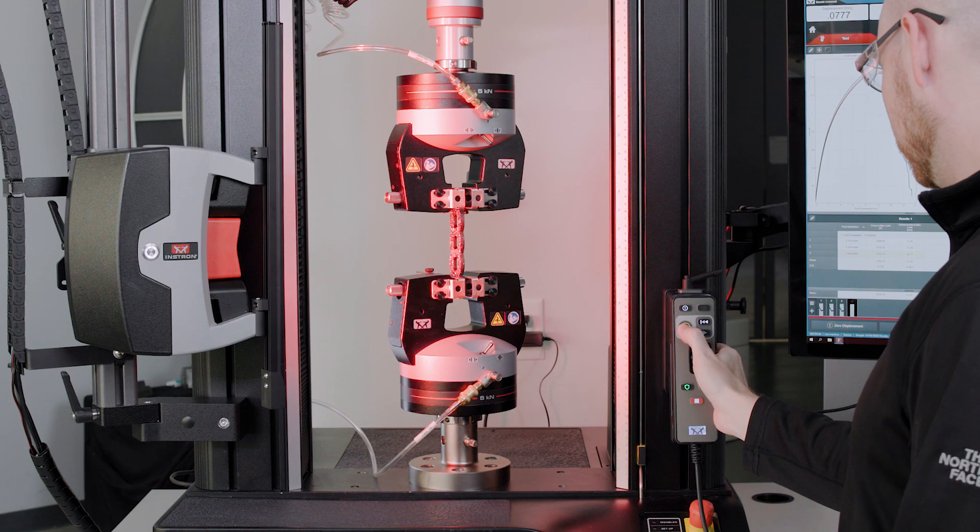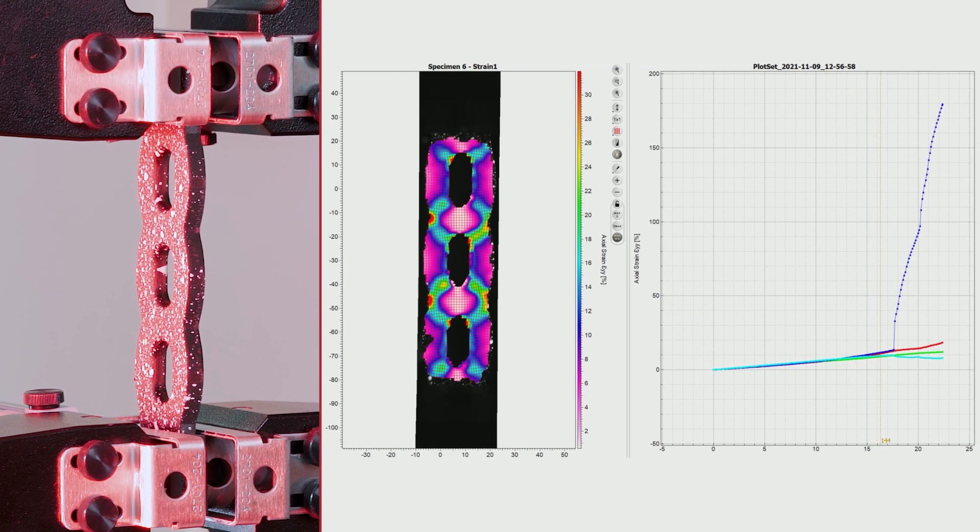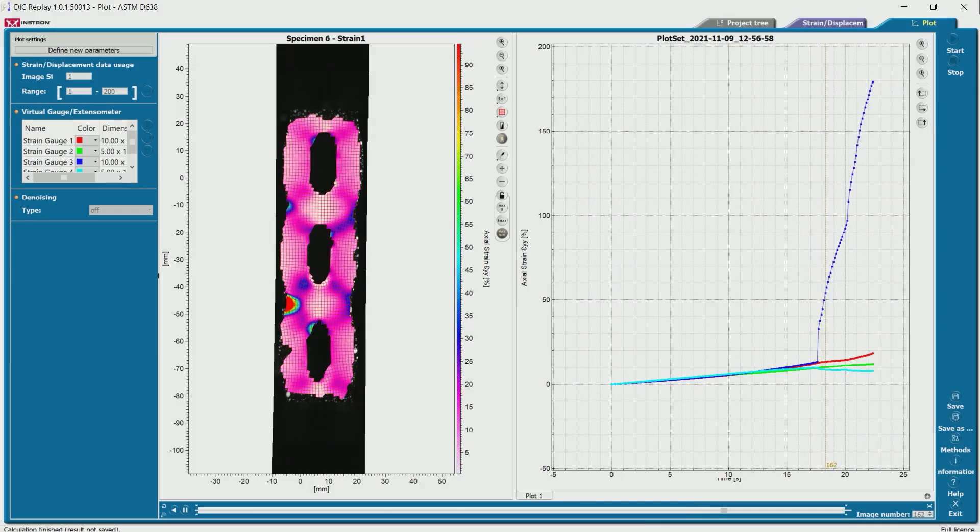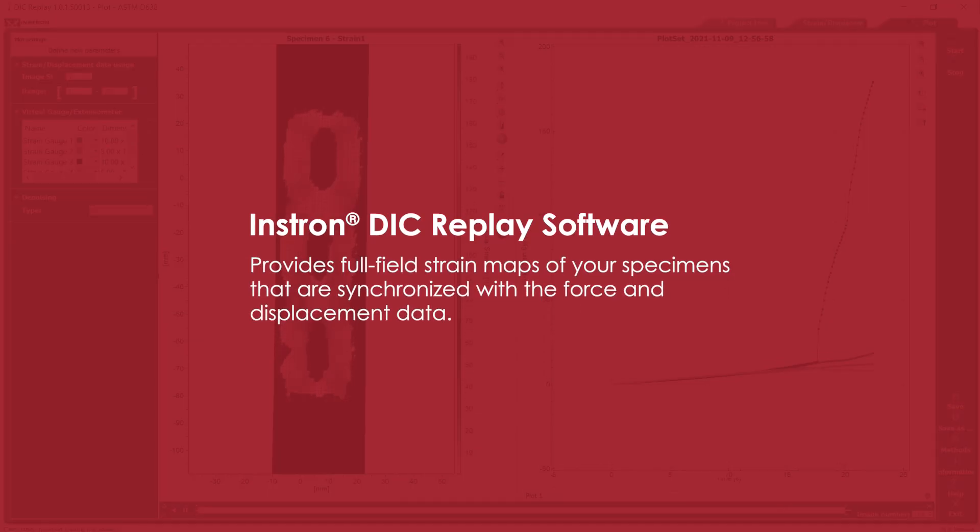The AVE2 can also record images of your testing to be used with Instron's optional DIC Replay software. DIC Replay is a 2D digital image correlation software that provides full field strain maps of your specimens that are synchronized with the force and displacement data.